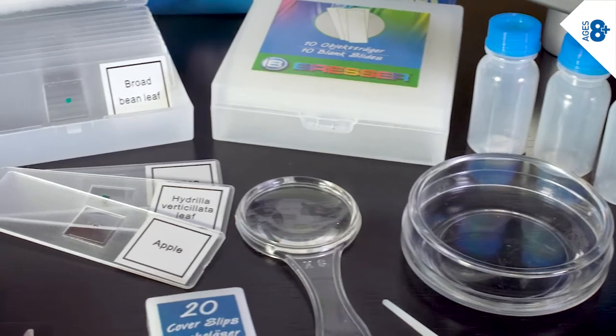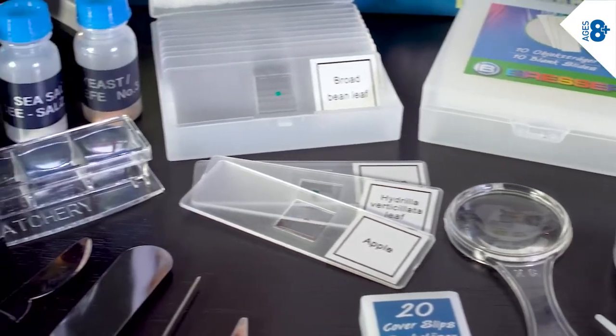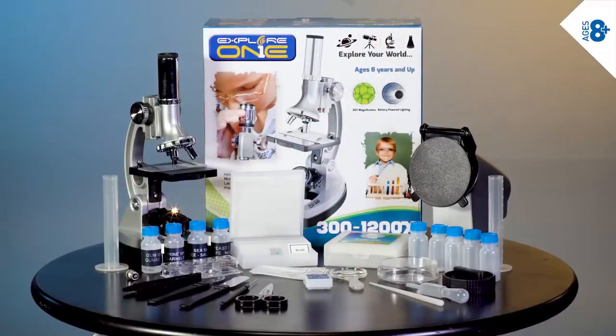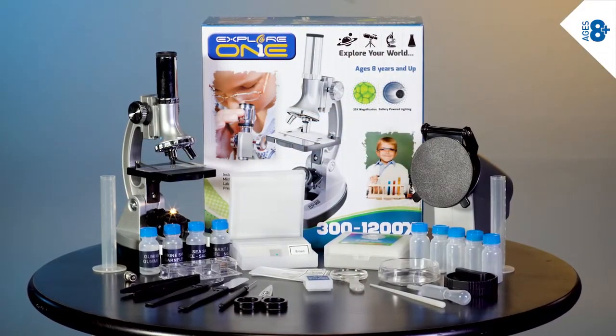It also comes with an impressive collection of prepping tools, prepared and blank slides, a shrimp hatchery, and instructions on how to conduct your own investigations with the Xplore 1 1200x microscope.